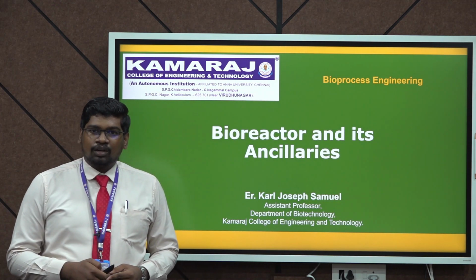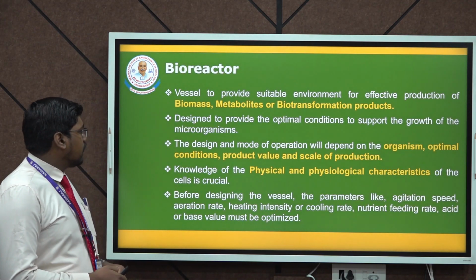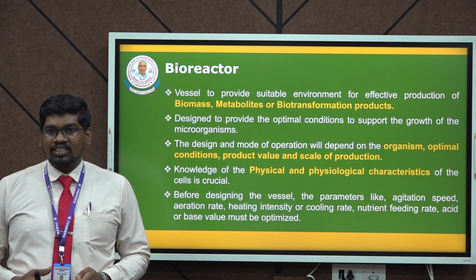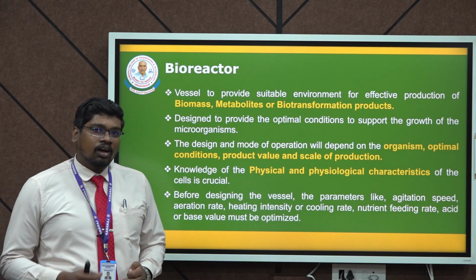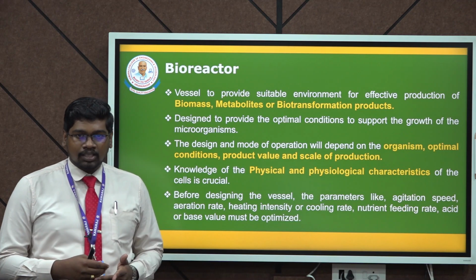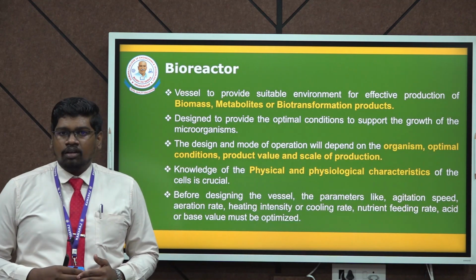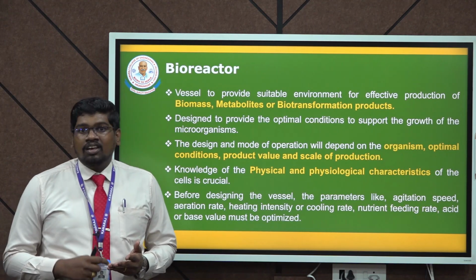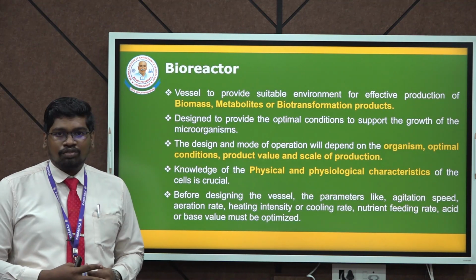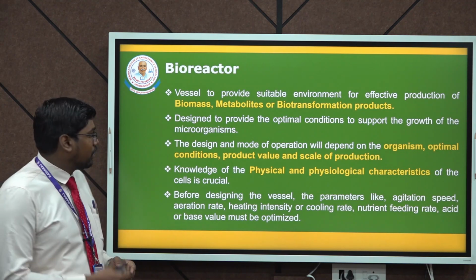In this video, we are going to see about the bioreactor and its ancillaries. Bioreactor is a vessel that is used to cultivate microorganisms for the production of biomass, metabolites or biotransformation products, which are the result of an enzymatic reaction. The bioreactor provides suitable conditions such as pH, temperature and other nutrients for the growth of a microorganism or the required condition for the enzymatic reaction.